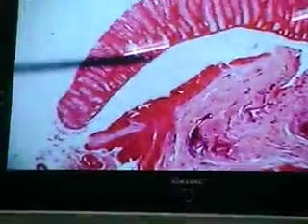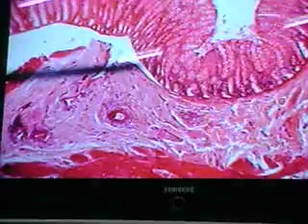So when you dissect the cadaver and open up the cecum in that region, you see very clearly the ileocecal valve. So this is a beautiful slide here. Thanks, this is your slide, Tom? Thanks a lot. It's a beautiful slide of the ileocecal valve, right in the region of the ileocecal junction. So there we see ileum going right into colon. This is a fantastic slide.